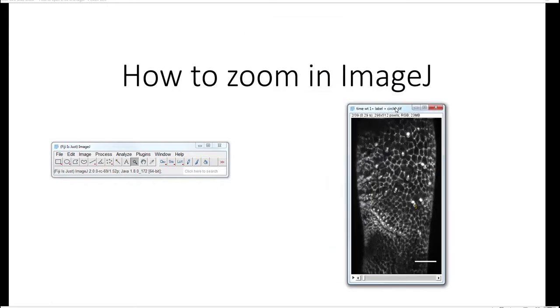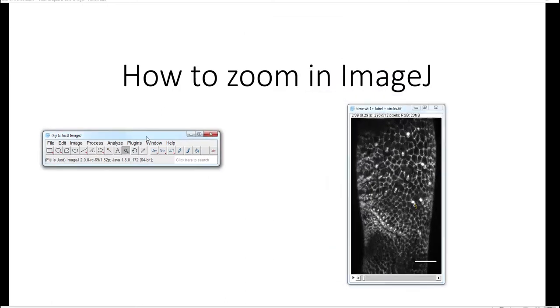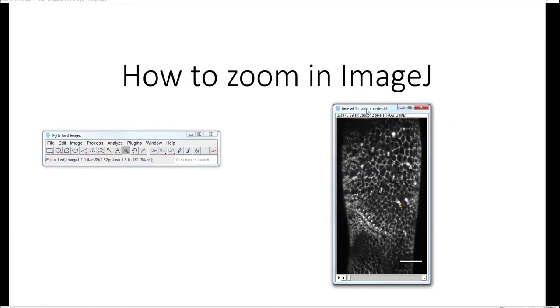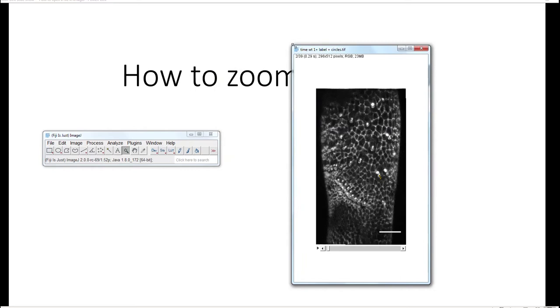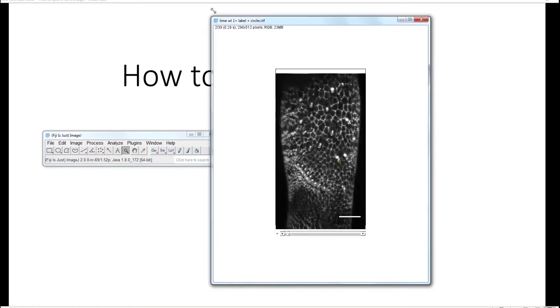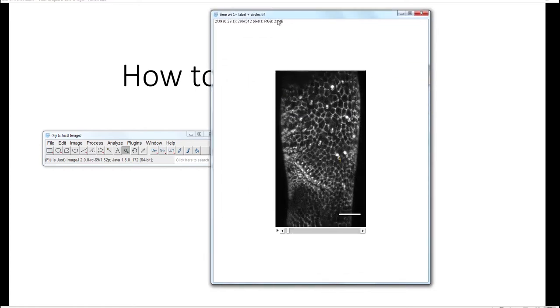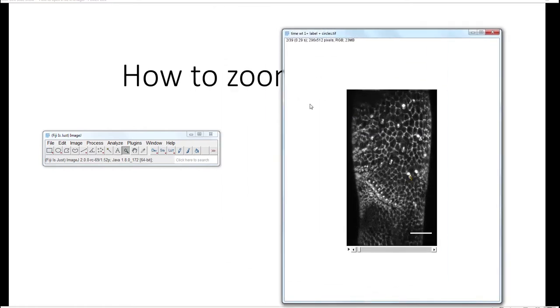How to zoom in ImageJ. You need to have your menu and the movie that you want to make bigger. Then you left-click and drag the movie to the size that you want. Suppose the movie is here and you can see this white space — you can click here.